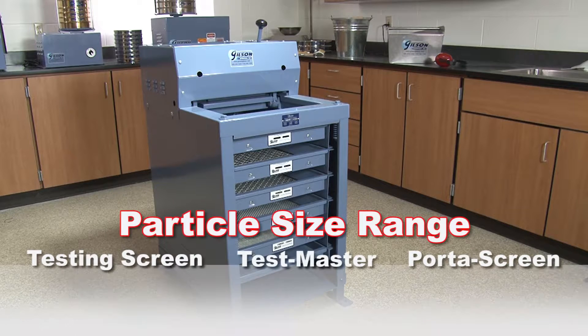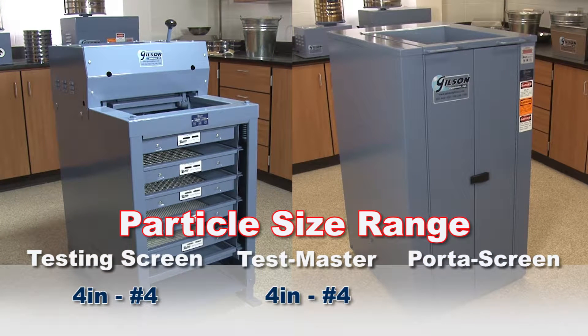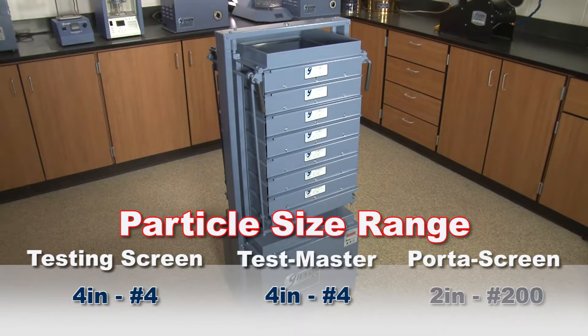Vibration and amplitude characteristics of the testing screen and Testmaster are identical and are optimized for effective particle size determinations in the four-inch to number four size range. Whereas the Porta screens are optimized for particle size determinations within the two-inch to number two hundred size range.